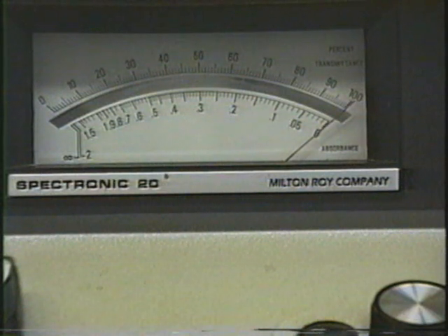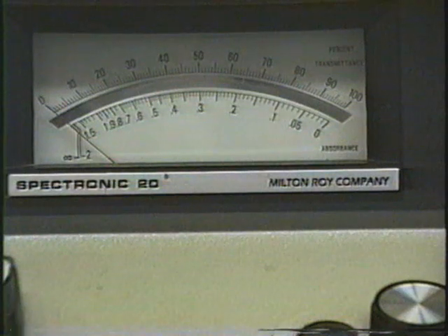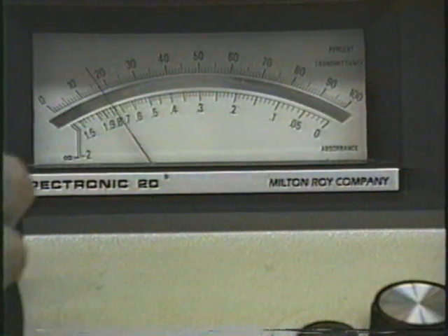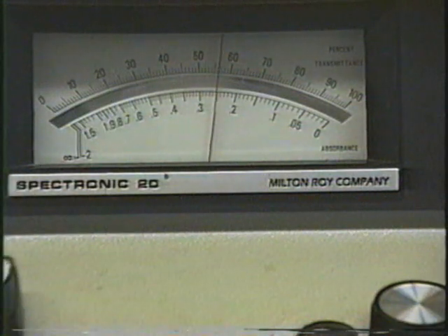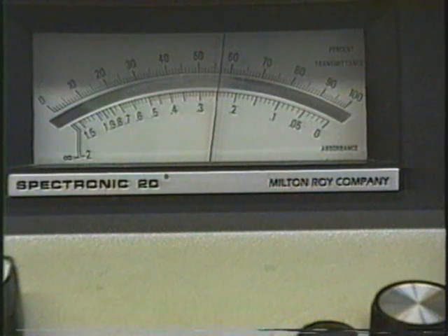There we go. Now the machine is set, back to 0. And again, line up the trademark with the mark on the sample holder and put in our sample. And now we read our sample. Our sample is reading 56.6 or 56.7. Well, it's drifting up a little bit.